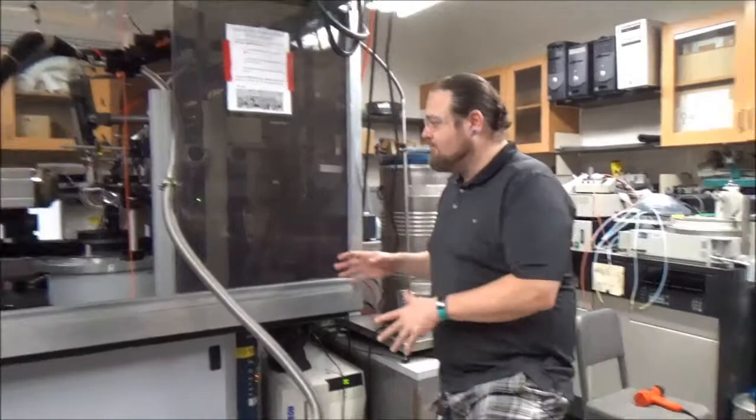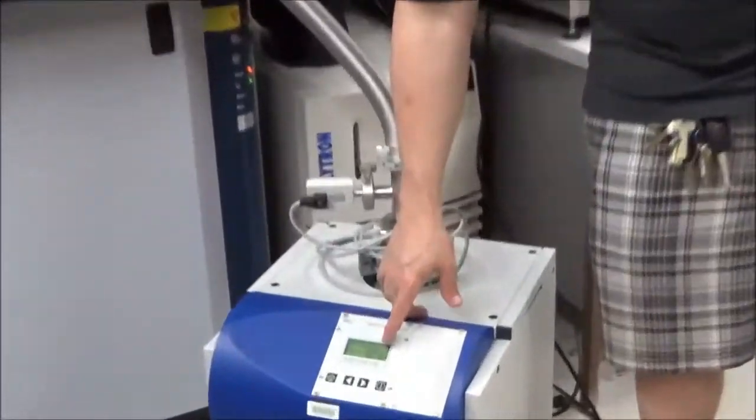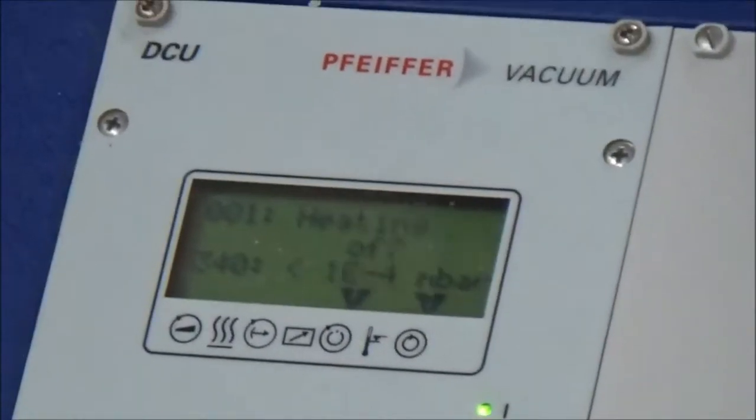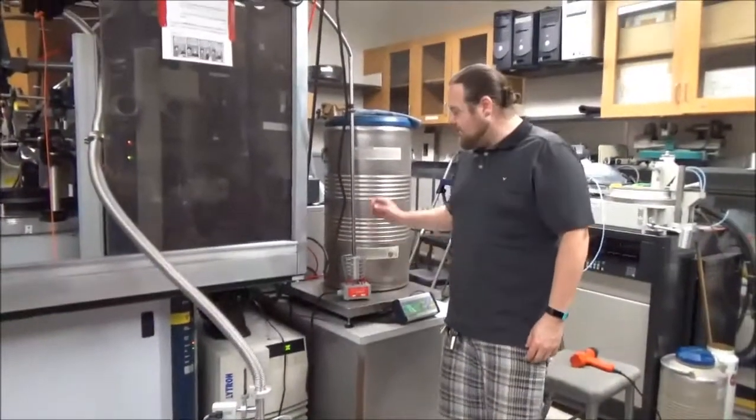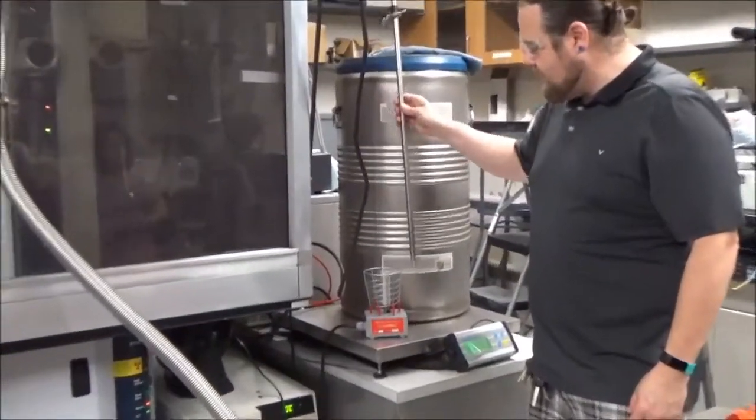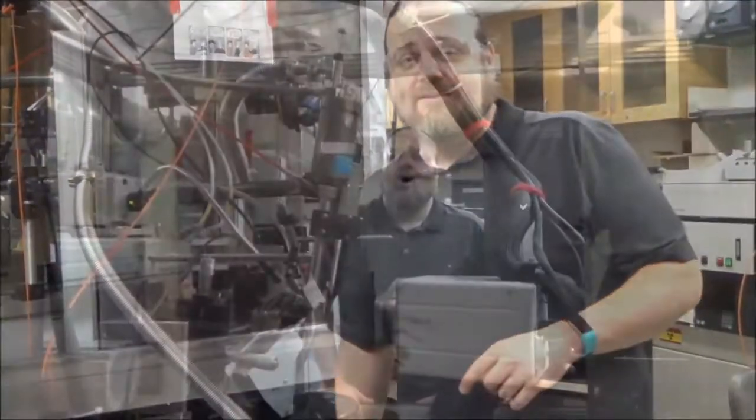Okay. So here we are about 24 hours later, everything's been pumped down. We can see on the turbo pump here that it's reading less than one times 10 to the minus four. So that's basically off the charts. What we're going to do now, we unplug the heater. We're going to remove the transfer line here and I'll show you what we have to do up on top in just a second.